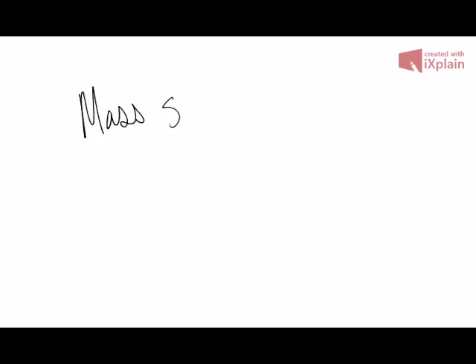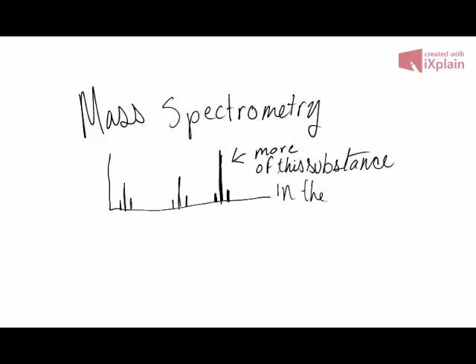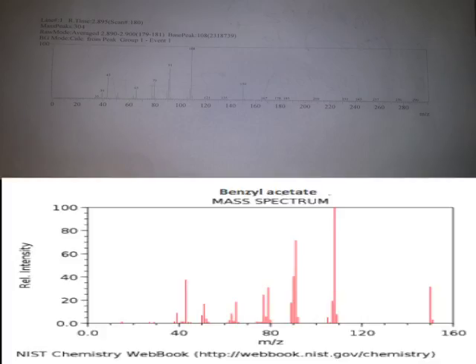Spectrometry is another method of analyzing the final substance that we employed. Mass spectrometry determines the chemical makeup of a substance by its separation of ions that make up the substance. The ions are separated by their masses and their charges. In our experiment, the mass spectroscopy compared with the sample mass spectroscopy for benzyl acetate shares the same distinctive peaks. They both have a peak at 150, 108, 90, 80, 65, and 43.